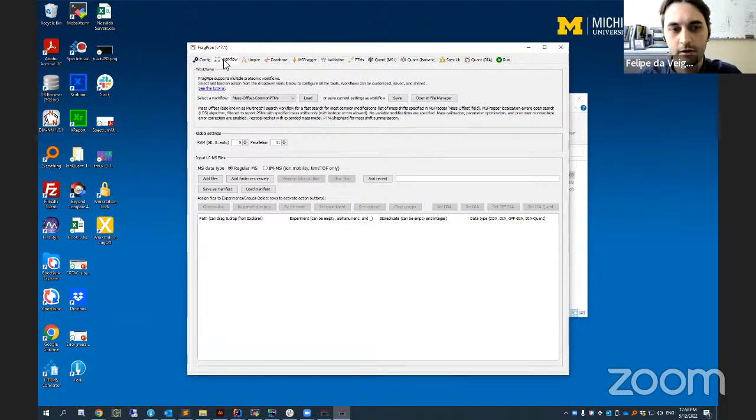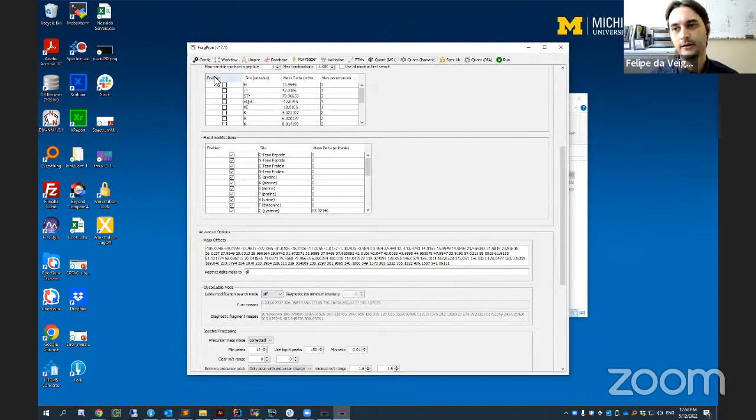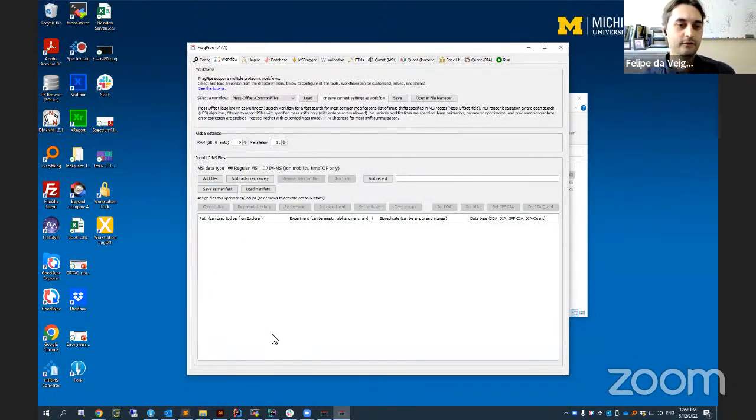Just to open a parenthesis here. This is probably the most important option in the program, the workflow selection, because FragPipe is basically a graphical interface that brings together all the tools that we develop here, and it orchestrates them so that the analysis can be done automatically. Instead of going tab by tab and program by program, setting all the parameters manually, we came up with the idea of offering predefined workflows.